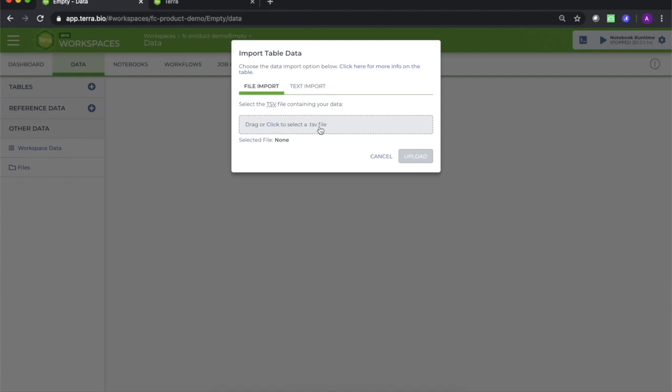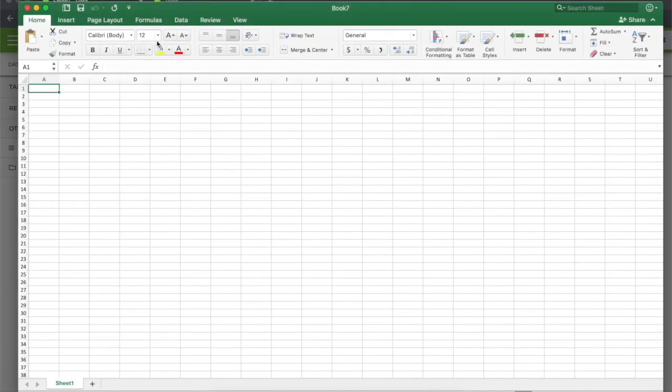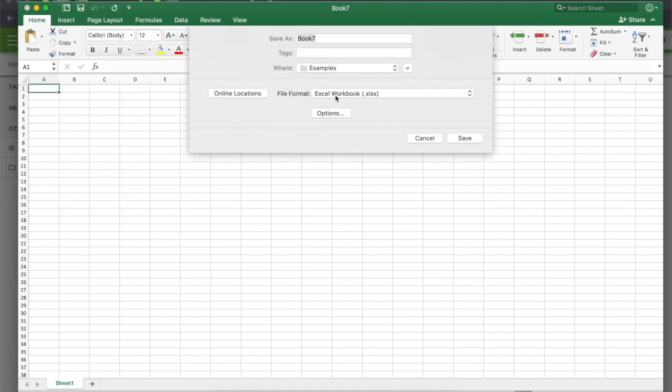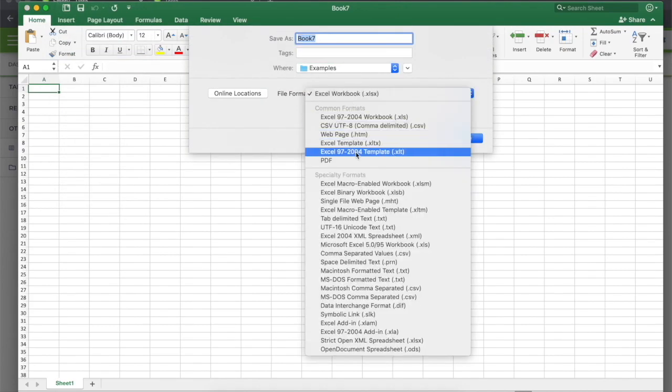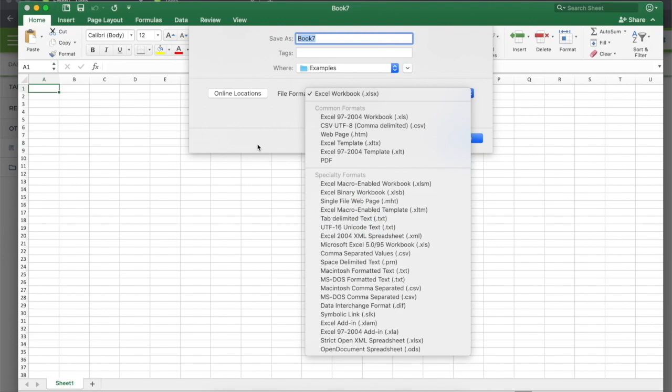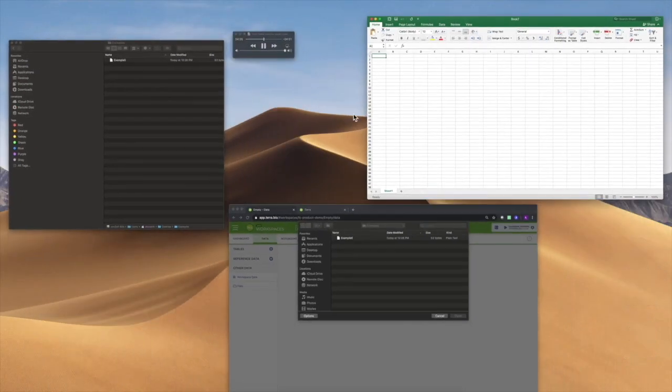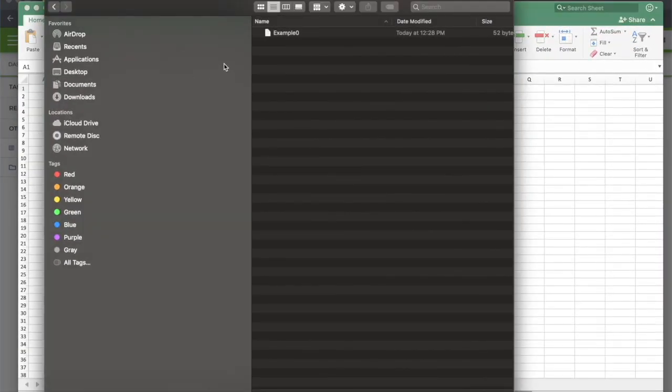Note that with some programs, this format is called tab-delimited text and is generated with a .txt file extension. This type of file is perfectly fine, but you may need to manually change the .txt extension to a .tsv extension.